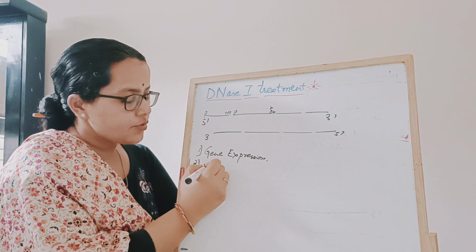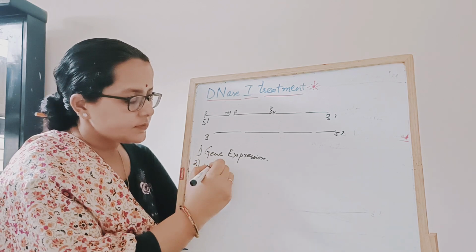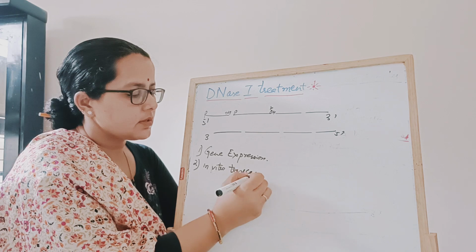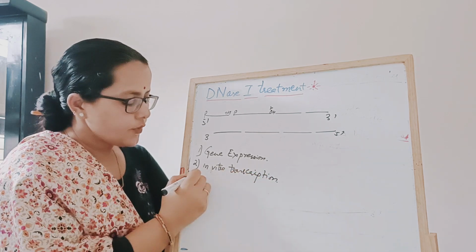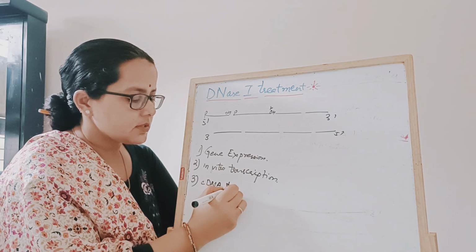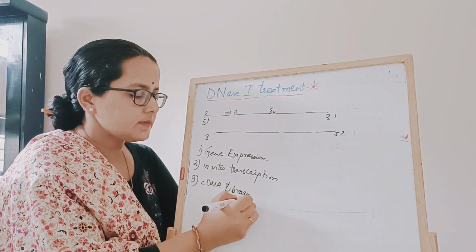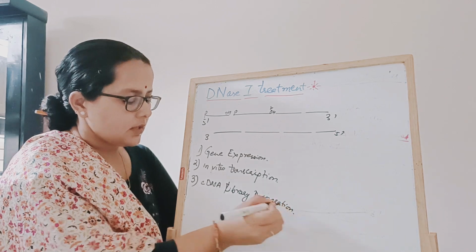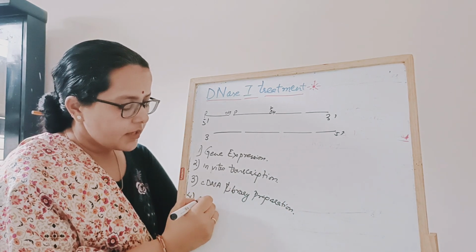Second, in vitro transcription. Third is cDNA library preparation. And fourth is RNA footprinting.